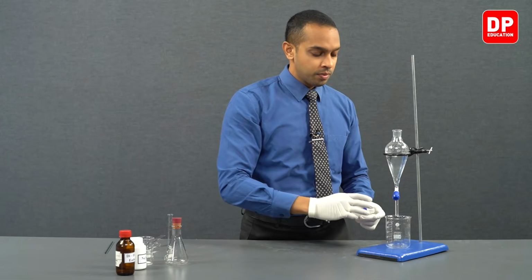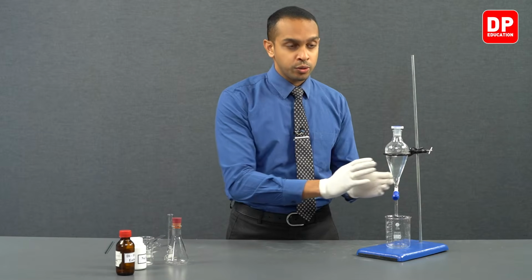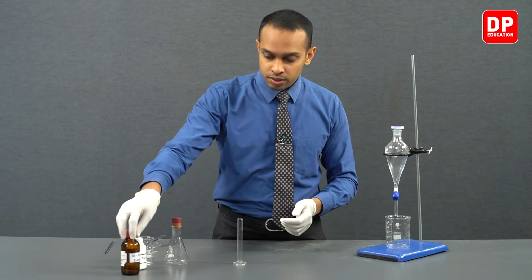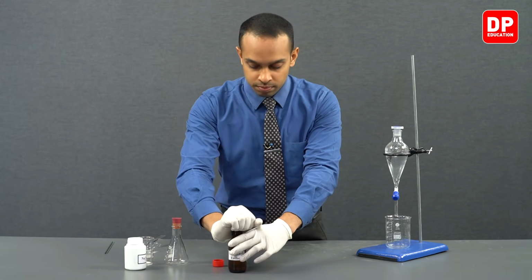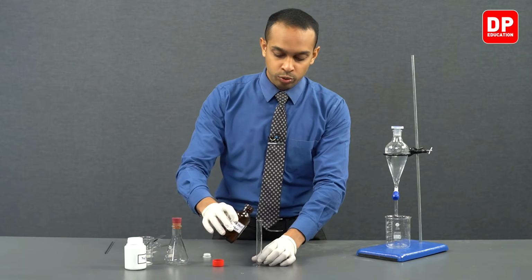Now, after taking our aqueous mixture into the separating funnel again, we are going to add 10 cubic centimeters of our diethyl ether into this one more time.